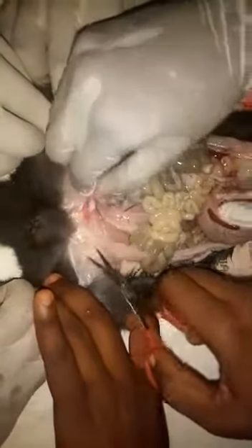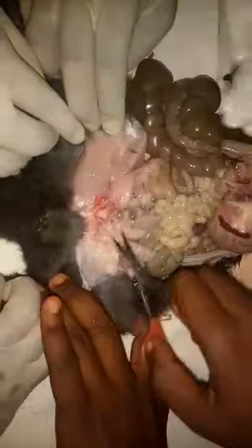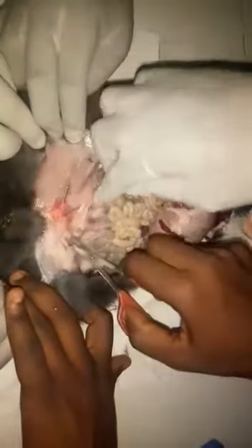Then where is the urinary bladder? The urinary bladder. Look at it. So I see it. See the urinary bladder. Don't tear it. Blood. See it. Wait, let me remove. Yes, we have seen it. See the urinary bladder. This is the urinary bladder, isn't it?